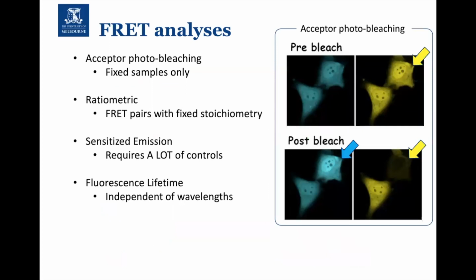There are a number of different ways of analyzing FRET. Probably again a bit too complex to go into within this lecture series, but one of the cleaner ways of doing it is using fluorescence lifetime. If you remember, I discussed that very, very quickly in the fluorescence section of this lecture. The nice thing about this is it's independent of the wavelengths of the light, so you're looking at the fluorescence lifetime of the molecule.